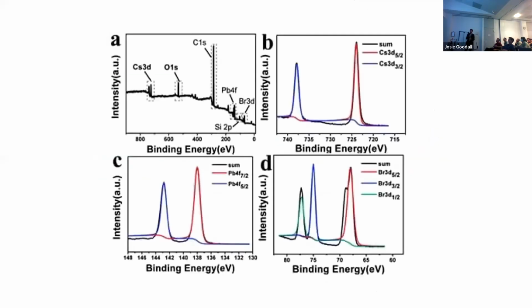Bonus round. Okay, so we can do audience participation. I found this one. I sent this on our WhatsApp group. I said, is this the worst ever published XPS spectrum, or XPS figure? Does anyone want to comment, critique?